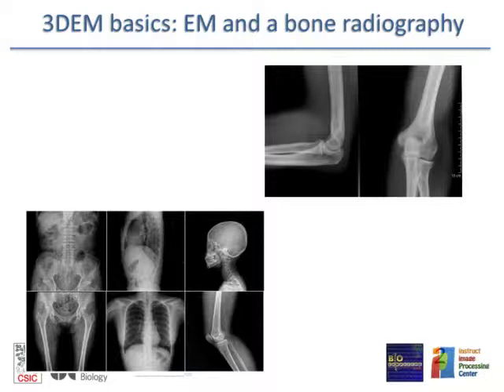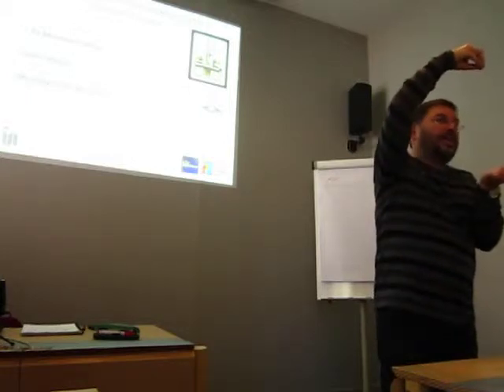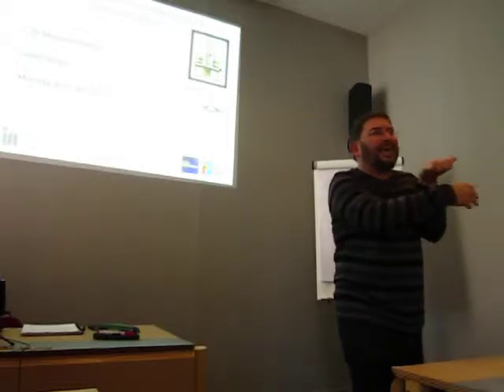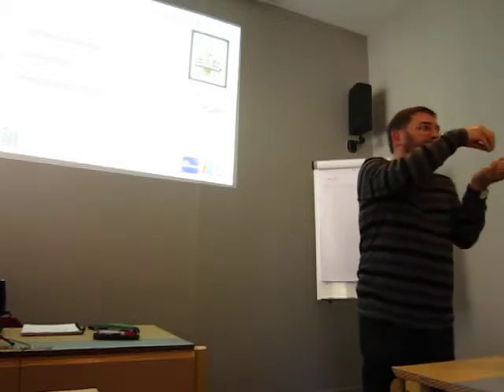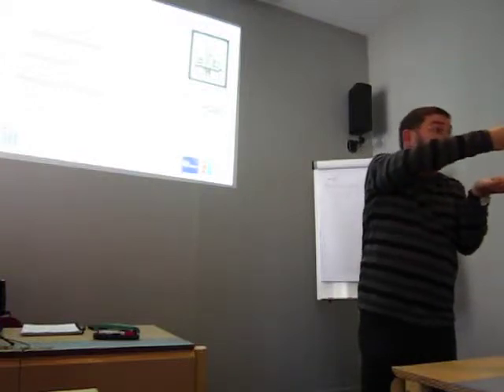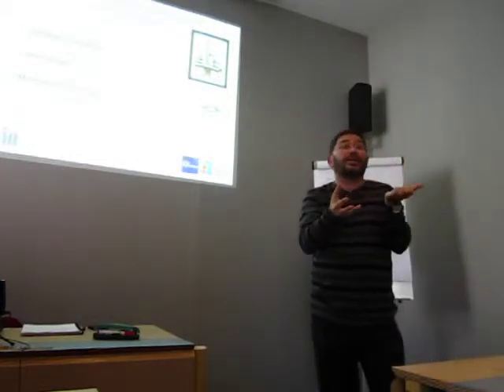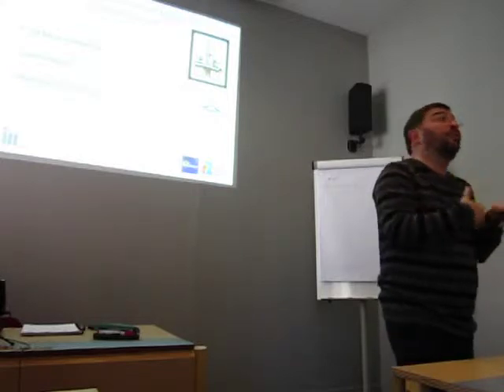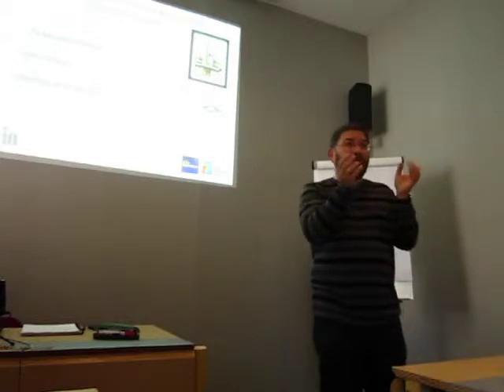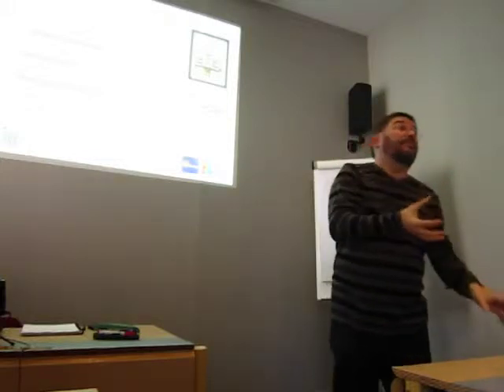Well, if everything sounds complicated, I hope it's not so much, but it may be. All of you have some approach already to this technology. But understand the interaction of the specimen. I'm talking of the specimen and the electron. The X-rays are going to go through and interact with everything, with the table, with all the metals around and all that. But I am talking just about the interaction of the specimen with the electron. As your electrons are more and more accelerated, typically 300 kilovolts, they go faster, they see less. So this approximation that your specimen is almost transparent to the electron is more and more correct as you go to higher voltages. The case of the 1 million volt microscope in which you had to make the alarm sound was because of the interaction of the electron with the microscope itself, not with the specimen.